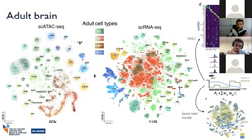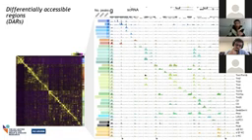And this way, we were able to annotate all these clusters, like the Kenyon cells here in yellow, the glial subtypes here in blue. The green are all the optic lobe clusters, and in red-brown is the central brain, which is much less annotated, as you can see. So then each cell type now, again, has a specific set of differentially accessible regions, as well as regions shared with other cell types. Here are many examples of genes, and here in rows are all the cell types where regions can be found of marker genes for that cell type that are specifically accessible there.